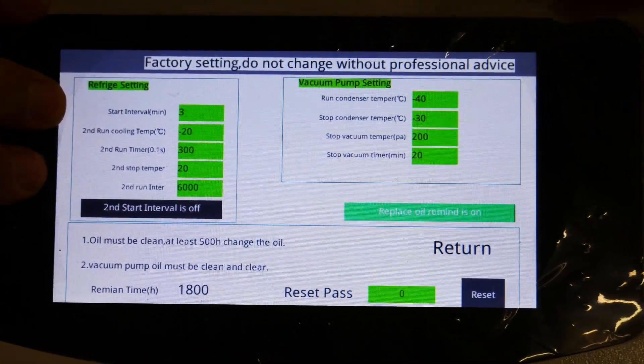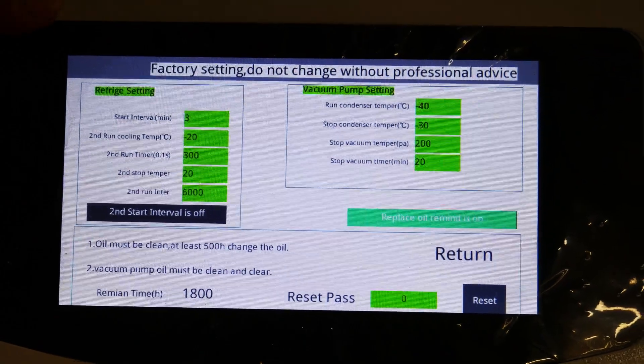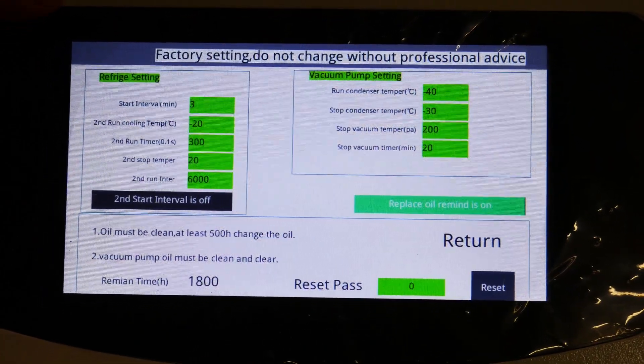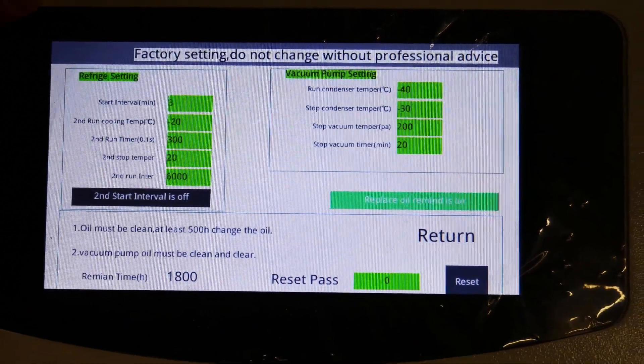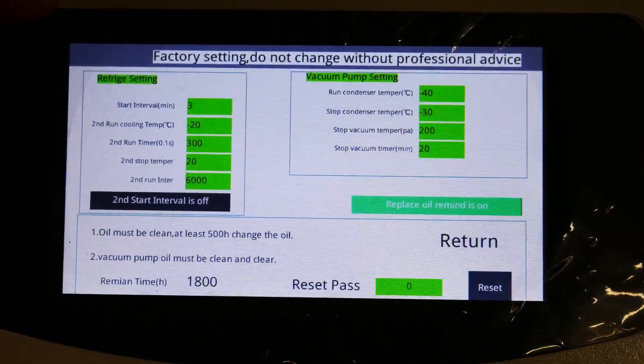The second stage is the vacuum system. Here, you can set up where and when you want the vacuum to come on and turn off. You can set up different Pascal, or how many minutes later the temperature has to come on, and it gives you the opportunity to run the system according to whatever you need.